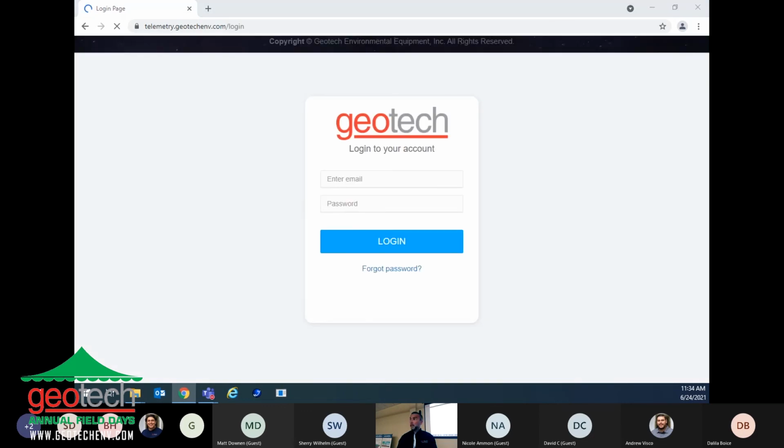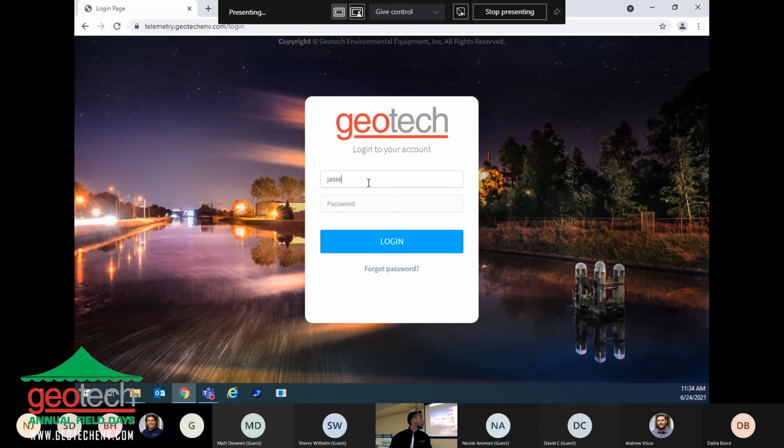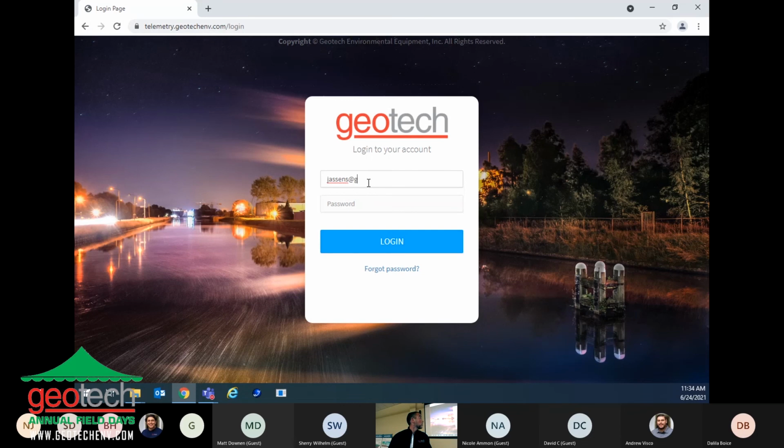All right, and I'm going to get over here and make sure I can share this with everybody. Is that showing online? Okay, perfect. Okay, so I'm going to go ahead and enter my email. Write this down if you have questions for later. And we're going to be brought into our SiteView site here in just a moment.